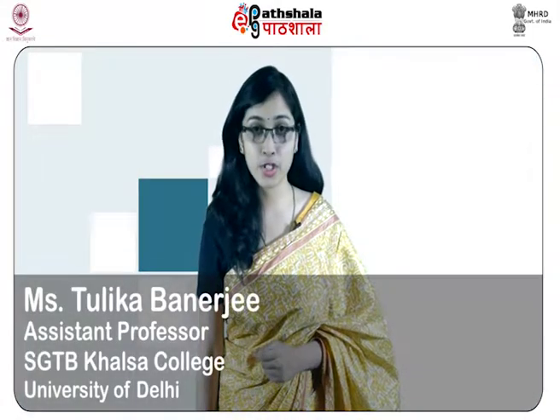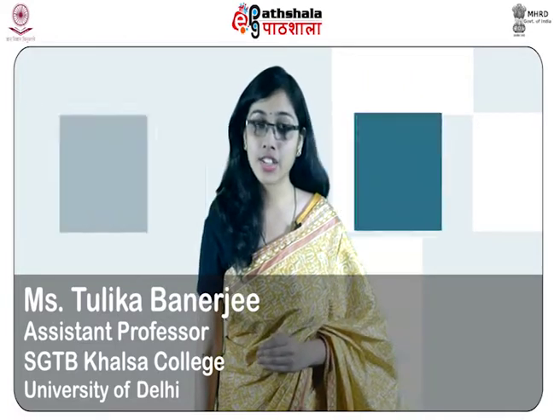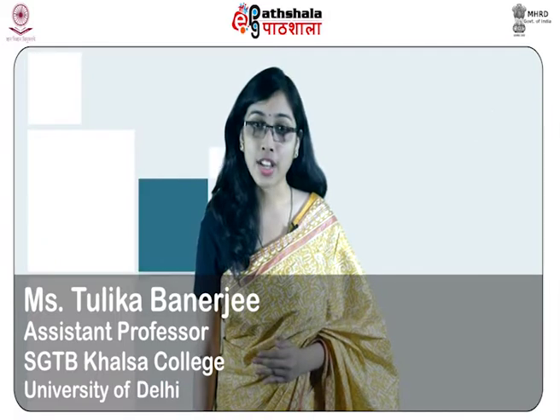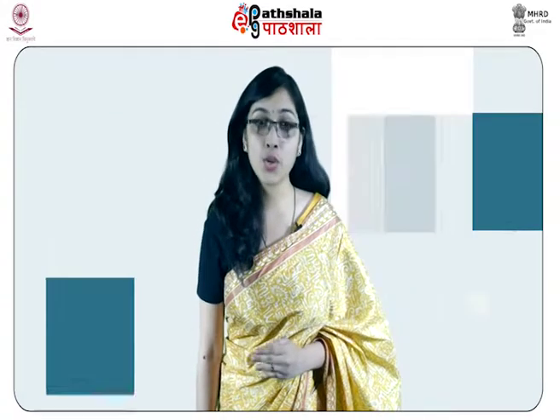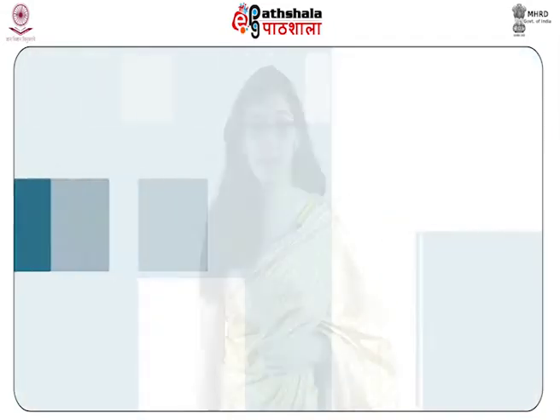After studying this module, you shall be able to know about collection of biological evidences, about packaging and documentation of evidences, and about the storage of evidences. Now, we will be starting with the introduction.